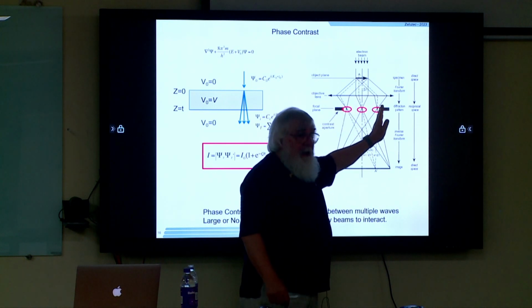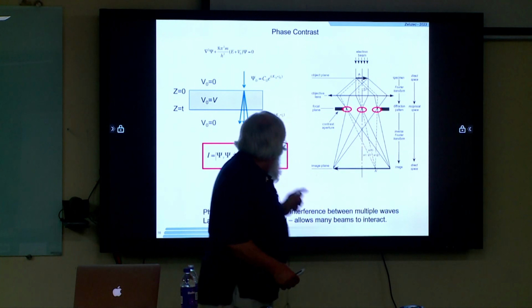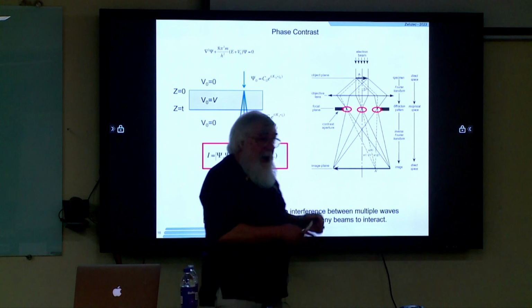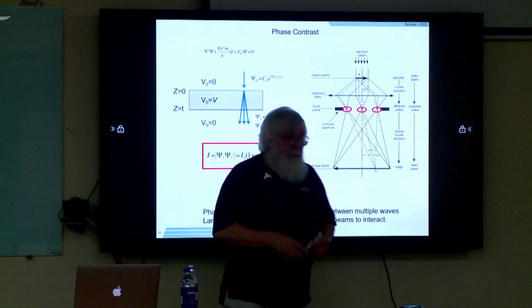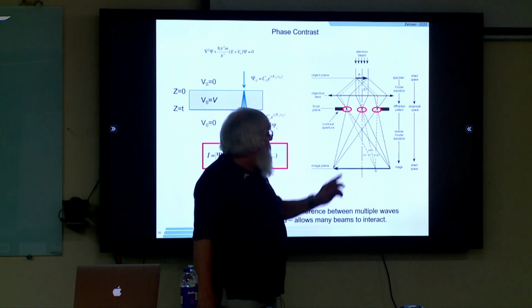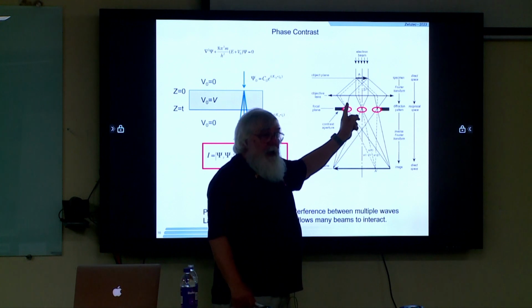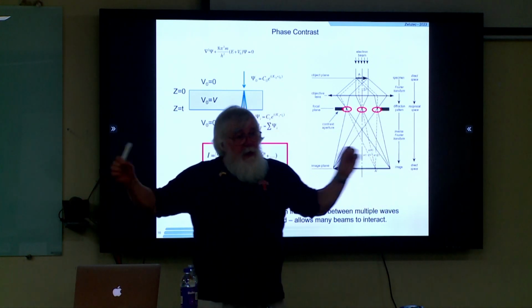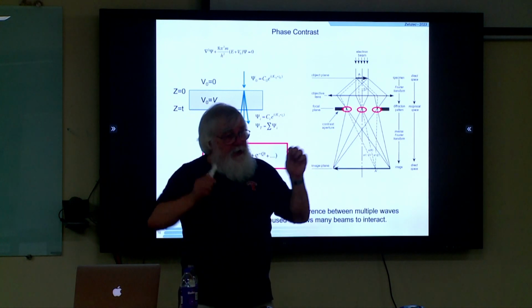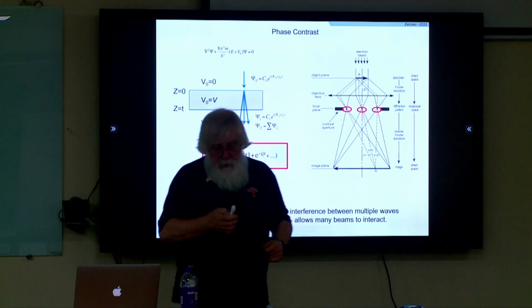Electrons coming off at an angle have a different phase. We can increase that phase shift, and hence the contribution here, by doing something very simple. Defocus the microscope slightly. When you defocus the microscope, you introduce a phase shift between the direct through beam and a beam that's off at an angle. Why? Aberrations. Changing the defocus changes the phase, and that's one of the terms in the aberrations.